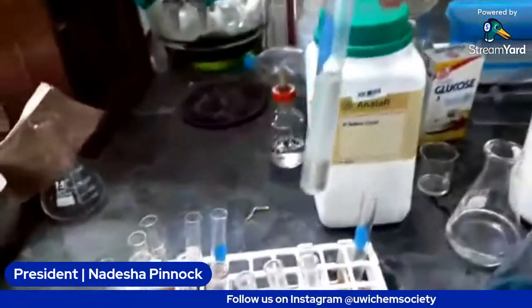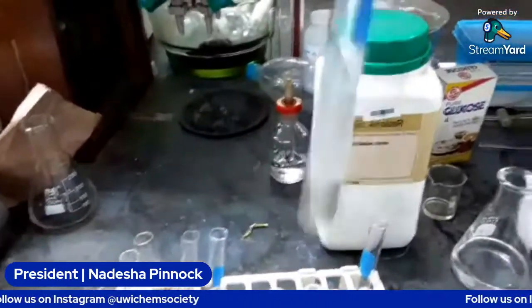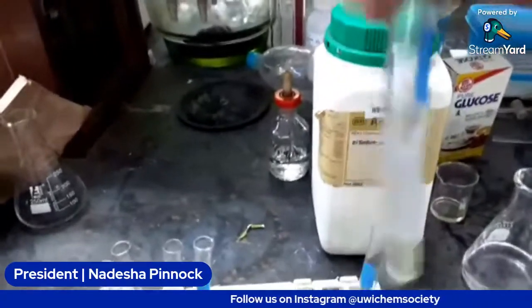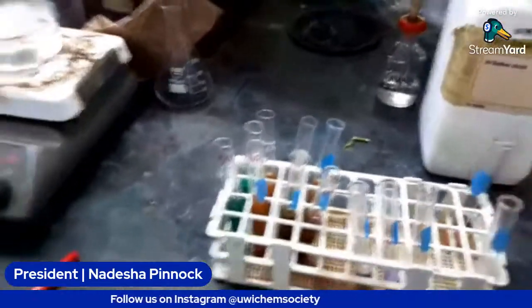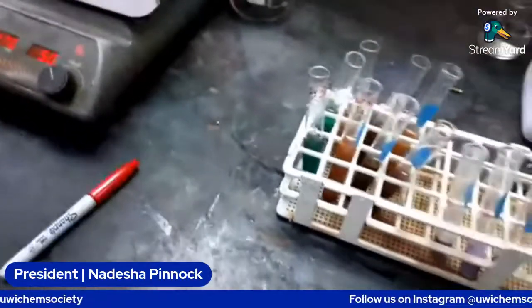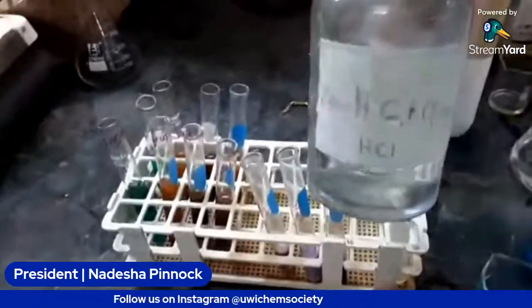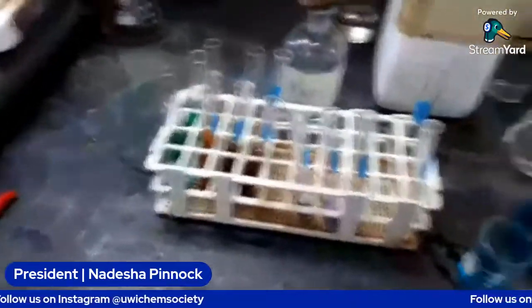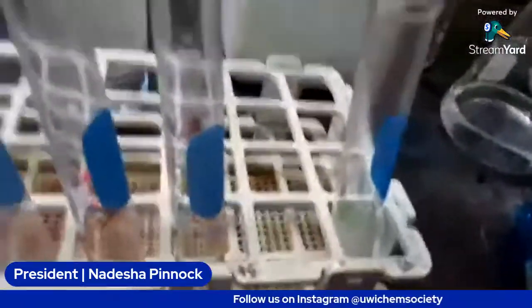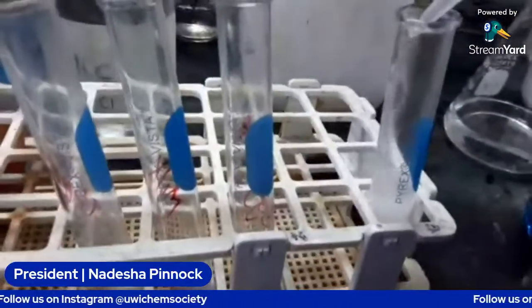So this whole thing separates, which alone can tell you that you have immiscible liquids, but we're going to add the water to it and mix it. For the sugar, we're going to do that one again, but we're going to add acid first. So we're going to add some HCl, and then we add the Benedict's to it, and then we boil it. So first, let's do the fat emulsion test. I'm just going to add some water to it.